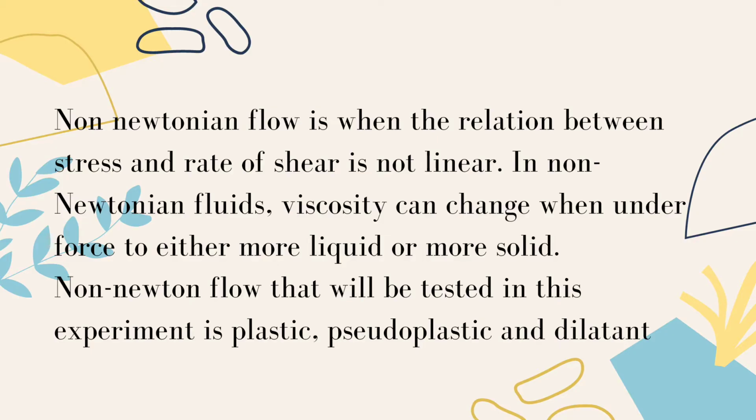What is non-Newtonian flow? Non-Newtonian flow is when the relation between stress and rate of shear is not linear. In non-Newtonian fluids, viscosity can change under force to become either more liquid or more solid. The non-Newtonian flows that will be tested in this experiment are plastic, pseudoplastic, and dilatant.